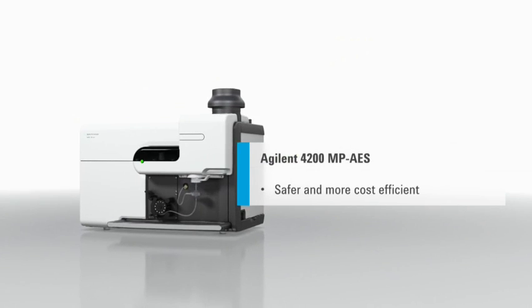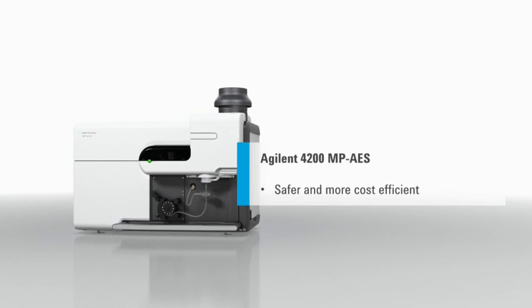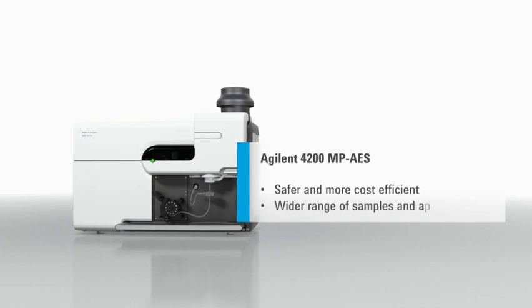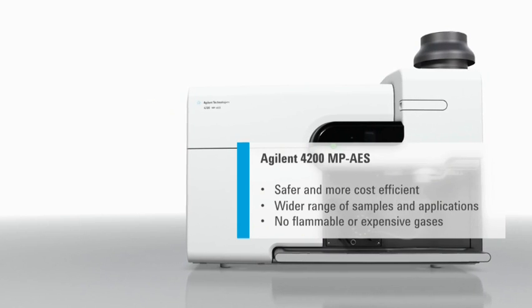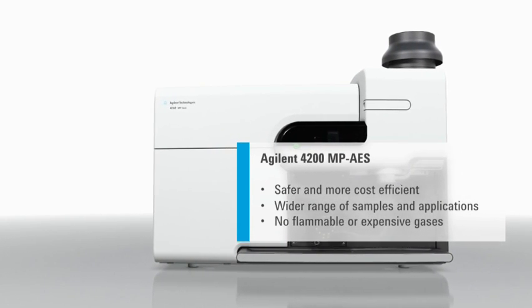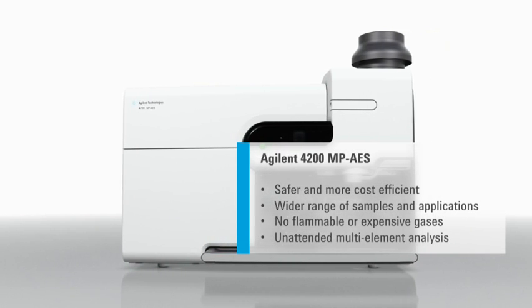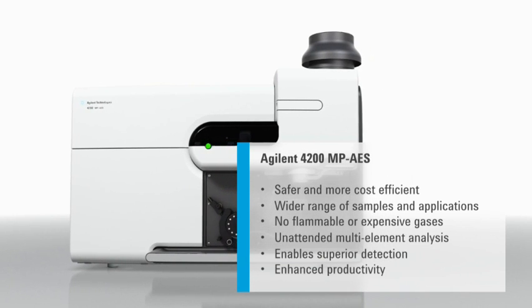While still offering safer, more cost-effective elemental analysis, the new 4200 MPAES is now suited to an even wider range of sample types and applications. The Agilent 4200 MPAES runs entirely on air, enabling unattended multi-element analysis with superior detection and enhanced productivity.